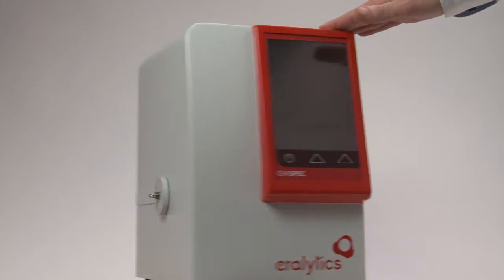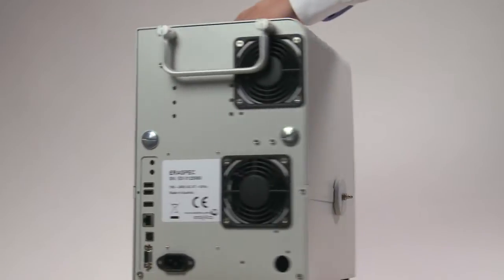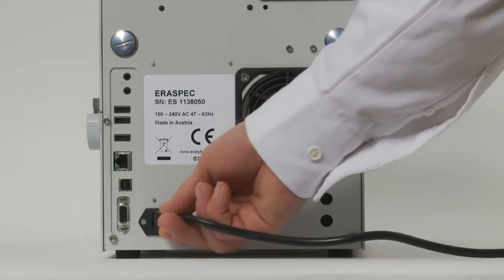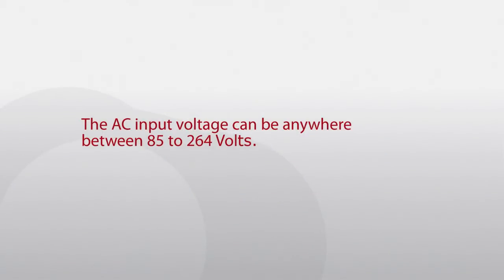Turn the instrument and connect the power cable to the plug on the rear side of the instrument. The AC input voltage can be anywhere between 85 and 264 volts.